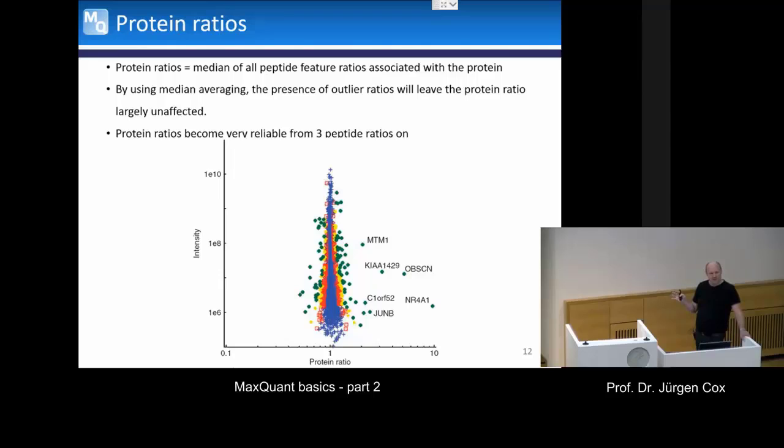So why does one do one here and the other there? Because of the very different nature of the data. With MS1 level labeling, there is no interference problem at all, basically. If there was any, because you had two co-eluting features of the same mass, it had been killed already by the things that we do within the feature to estimate the SILAC ratio, for example.